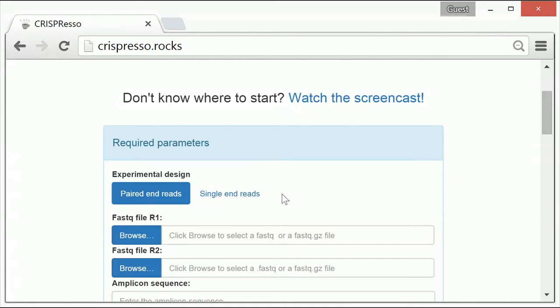The second is to upload your sequencing data in FastQ format. And third, you must enter the reference sequence for your amplicon of interest.